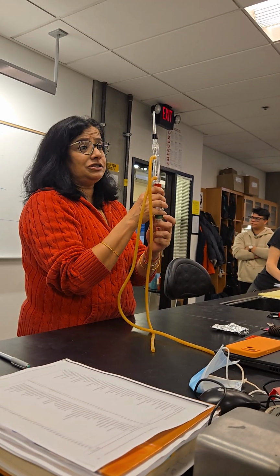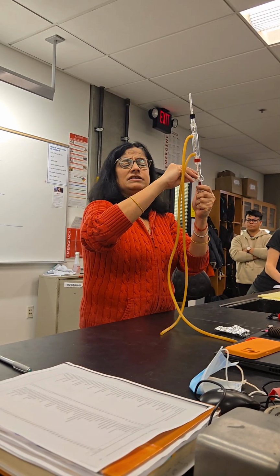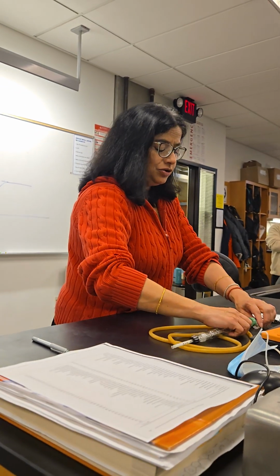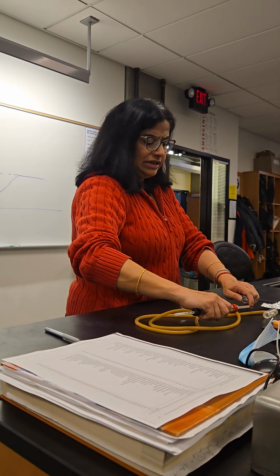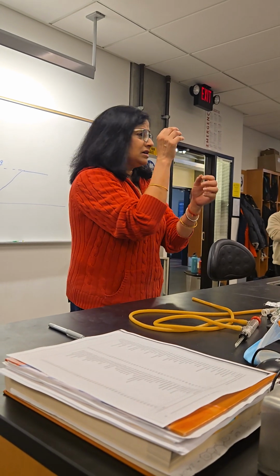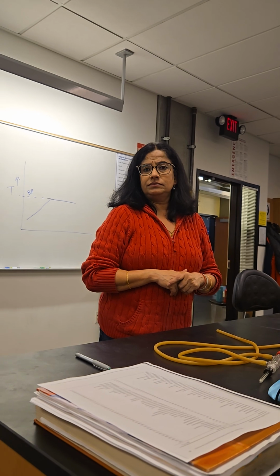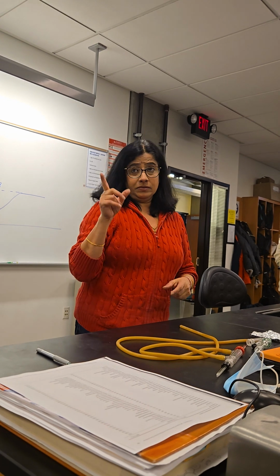Any questions about distillation? So your distillate will come here, and as I said, periodically you might need to empty this out because there isn't enough space here. So once you have your distillate collected, that's the liquid you will use to do IR on. So when you ask, should we save a little for IR? Not really necessary, because your distillate that you get after distillation is done, we will use a drop of that to do IR. So we heat it up till it starts boiling. No, you heat it till your distillation is done, right?